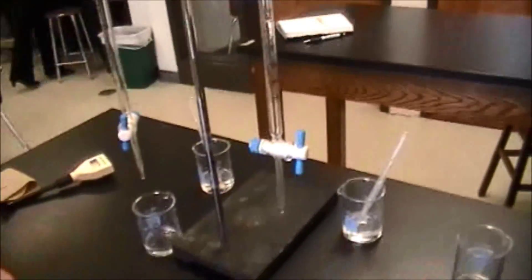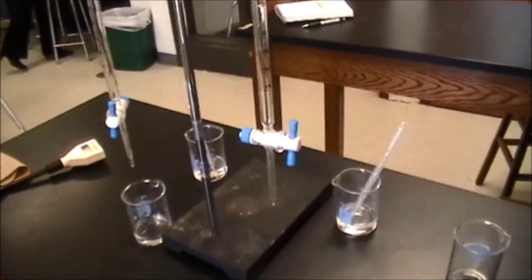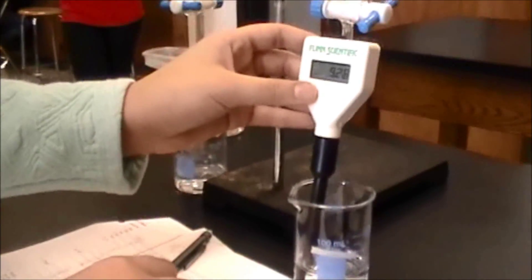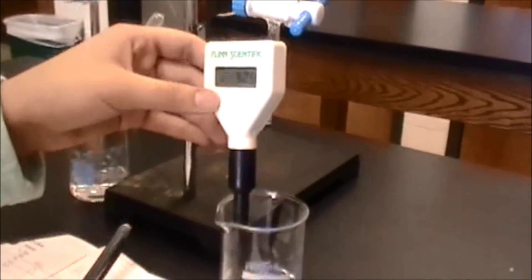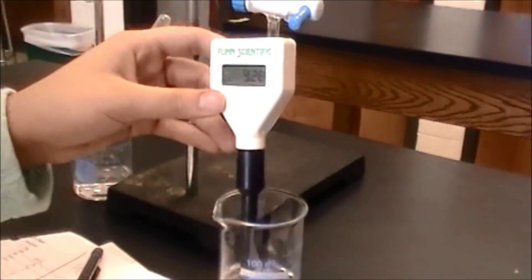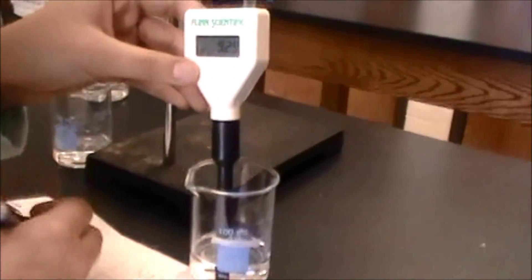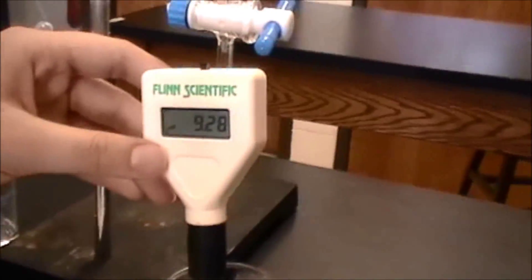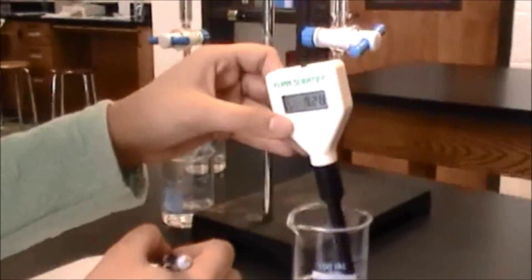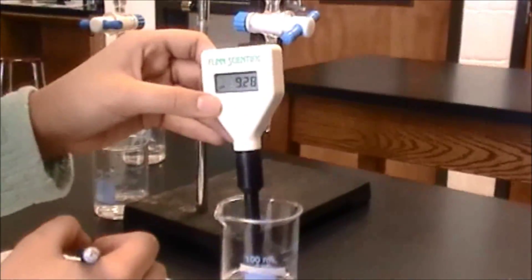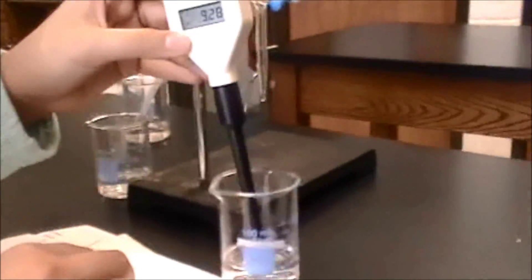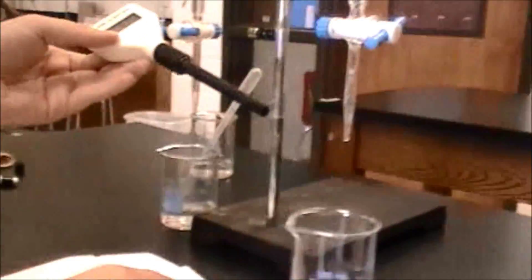Cool. Here's Rana taking pH of the solution after the second drop has been put in. So it's reading 9.28, and we're wanting it to read around 9.2, so that's pretty good. Or we want to keep it around 9.2. So we're going to keep adding milliliters and see how the pH goes.